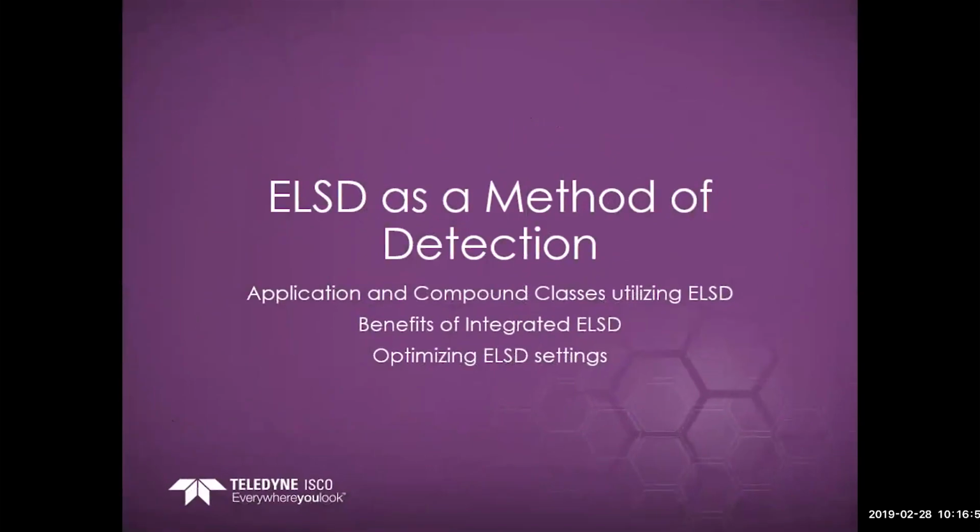So finally, next we want to discuss ELSD as a method of detection, and I'm going to go over 3 different areas here. I'm going to discuss the application and compound classes that traditionally utilize ELSD, the benefits of our integrated ELSD systems in both our flash and our prep systems, and then what ELSD settings you can change and optimize depending on your needs.